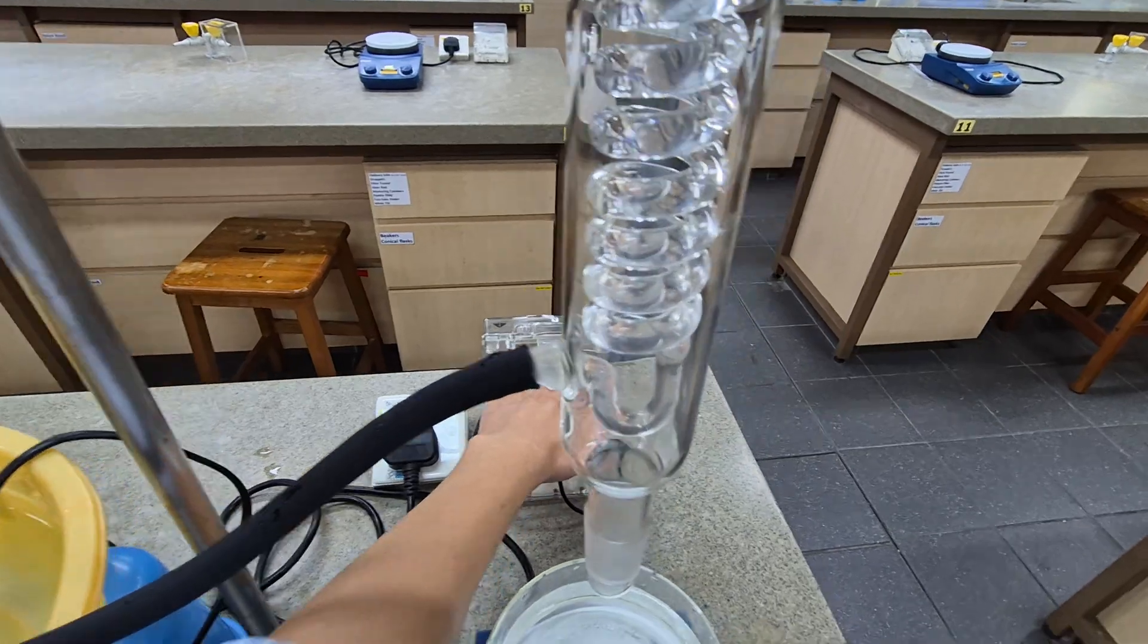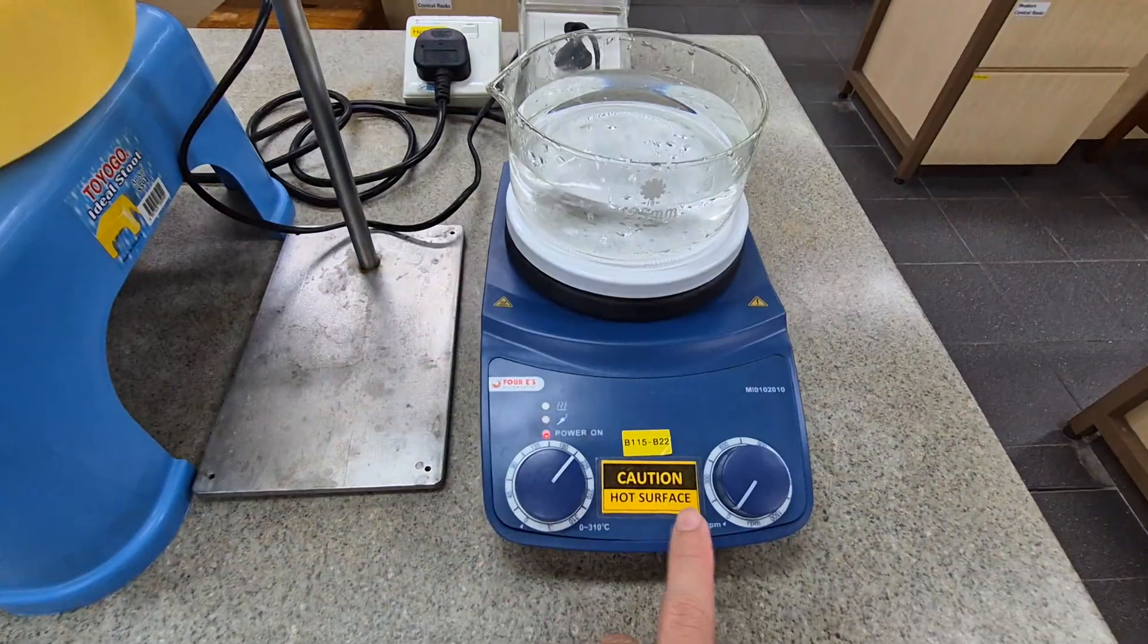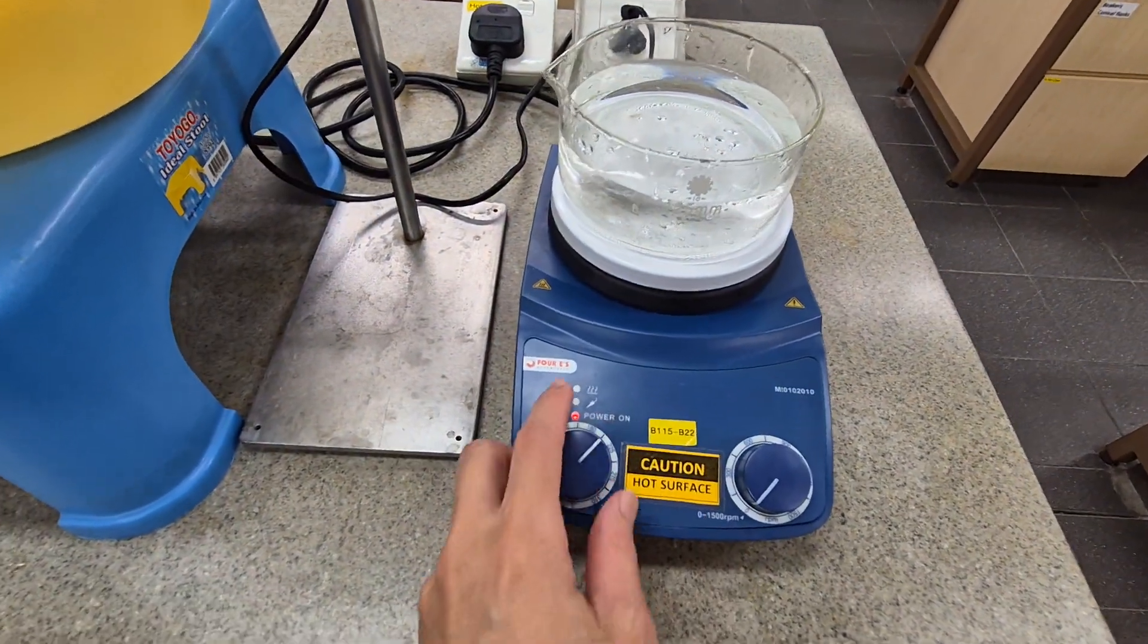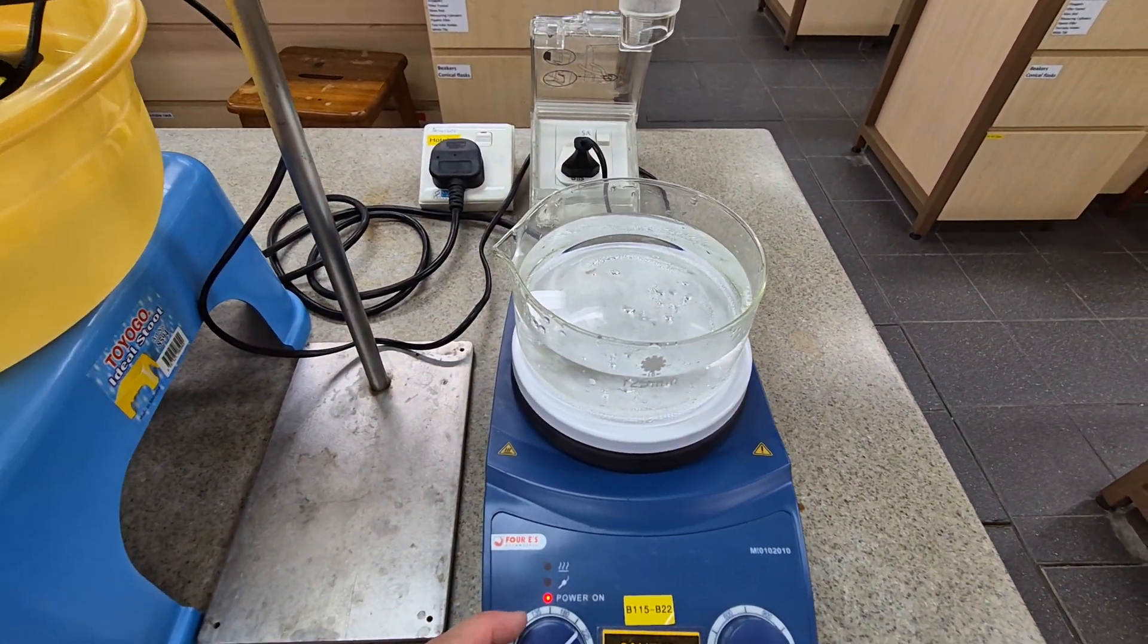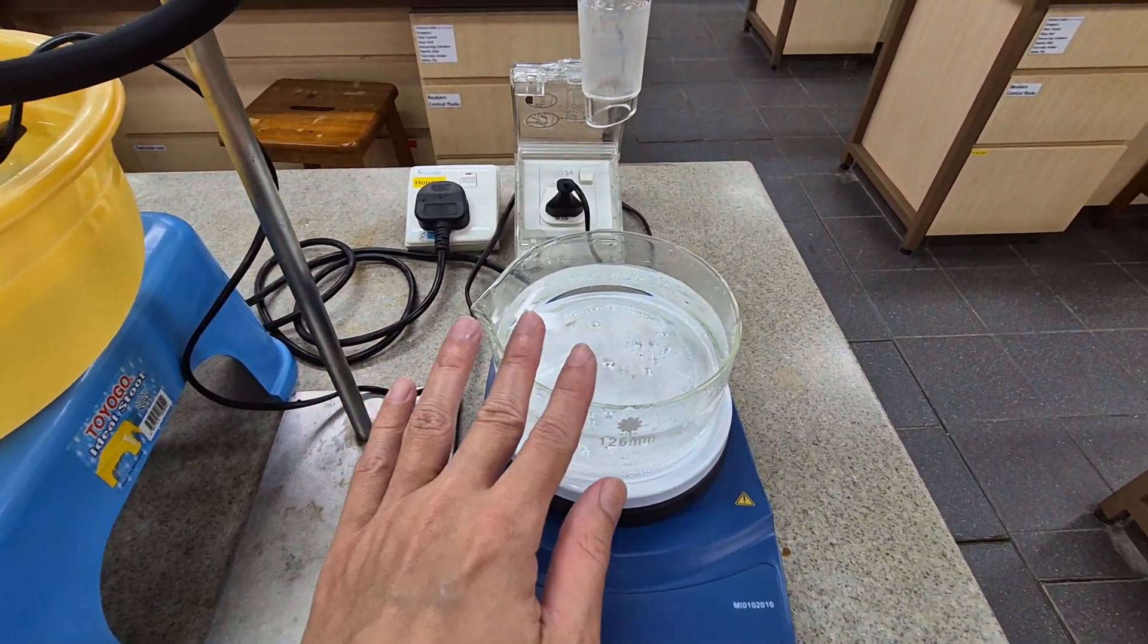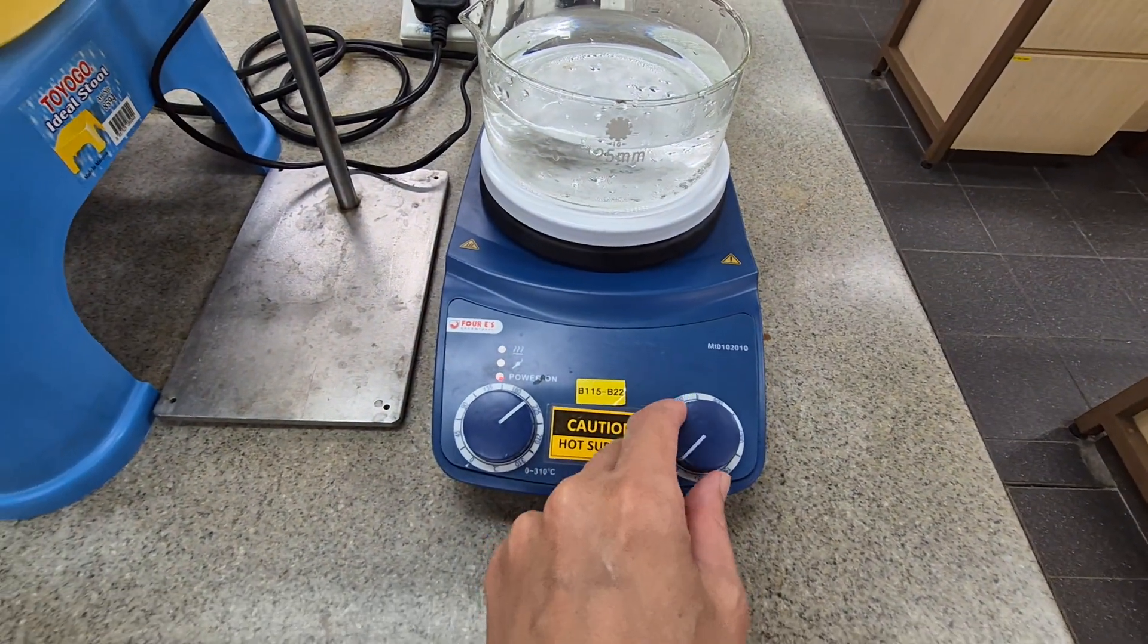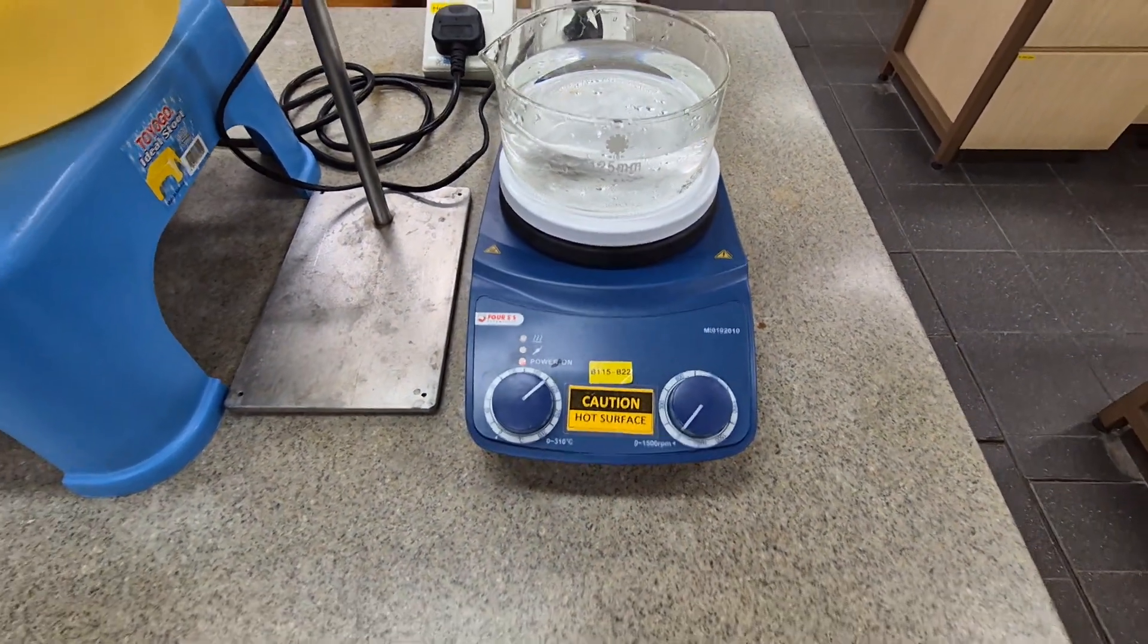This is the hot plate with the magnetic stirring function. This is the temperature control. You can see that I have already switched on the temperature because I want to heat up the water bath. This controls the magnetic field so it allows the magnetic stirring bar to stir and helps to stir the reaction mixture.